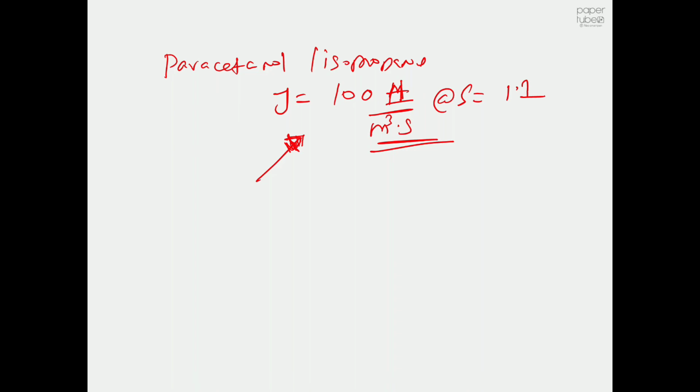So that's why I showed the whole experiment, how we performed it, how we know when a system has nucleated, how we rely on our eyes as the solution changes from clear to cloudy, and use that as the point of nucleation.